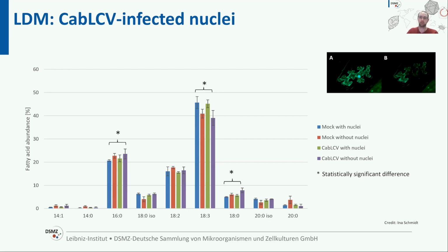within our metabolomics facility. And we could then really show that there are changes happening in the lipid composition of infected and non-infected cabbage leaf curl tissue, but only in some cases. So there's more work to be done, but it's an interesting field of view.